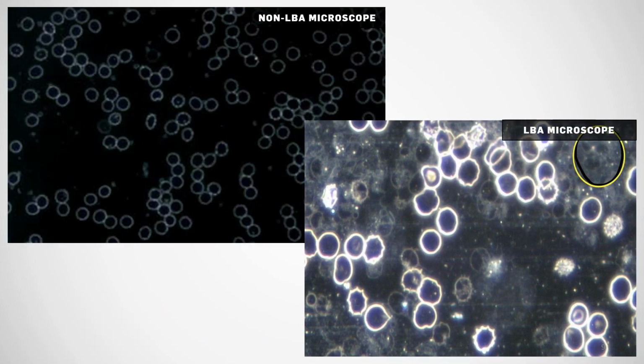Right, so also just a comparison there, and these images haven't been adjusted or edited in any way. That's actually what was sent in. So I think also an issue with the camera being used as well, which is also something to look at when looking at a microscope. The type of camera is quite important as well. There are some specifications that one really needs to pay attention to, not just the resolution.